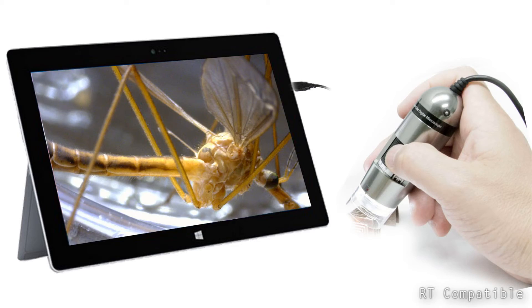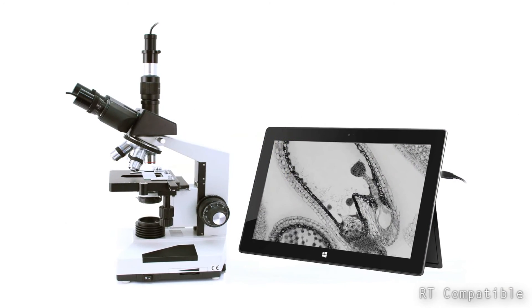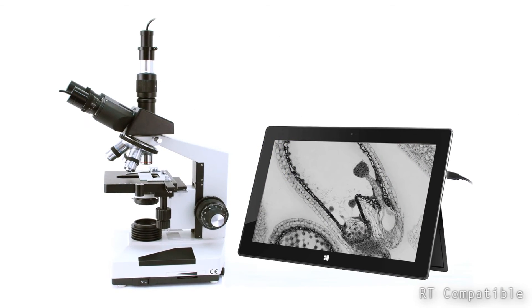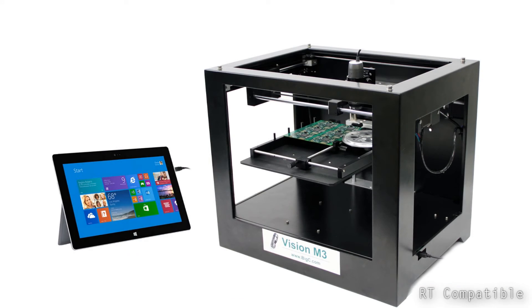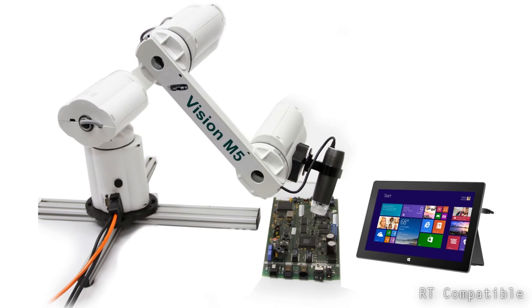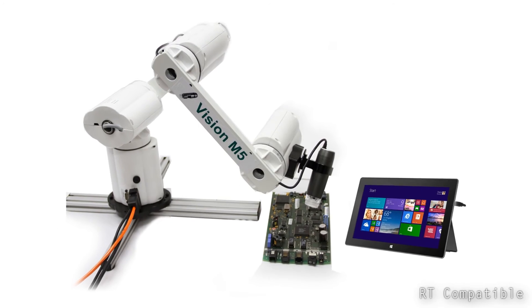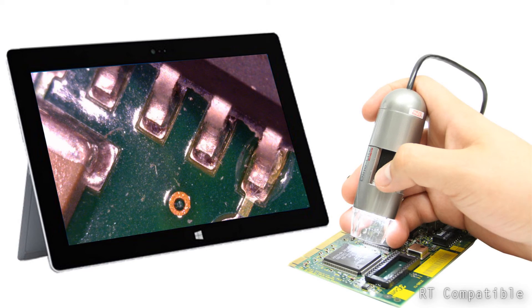Windows RT with Dynolite can be a very convenient and powerful tool for the ultimate in portable inspection in any application and in any location.